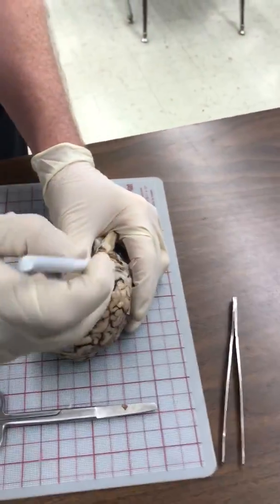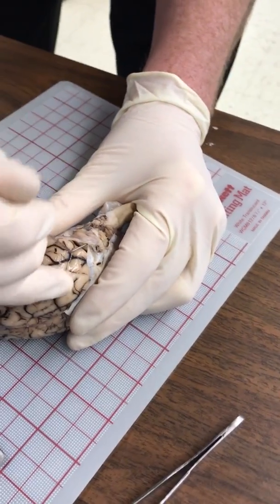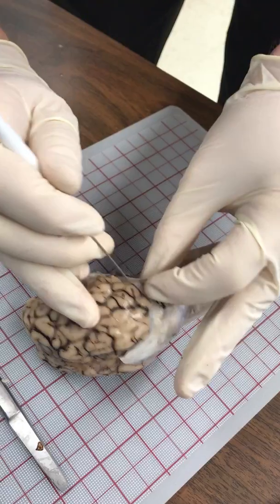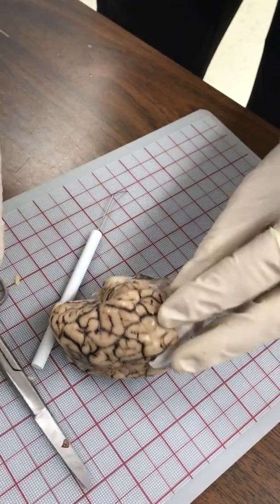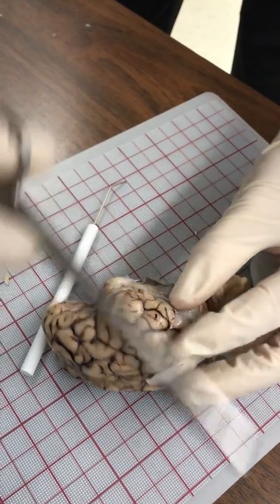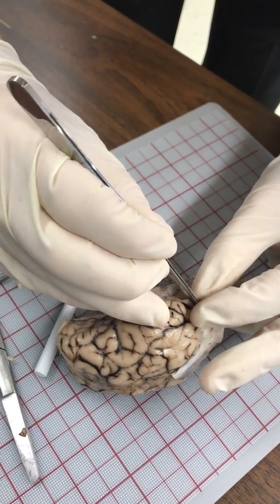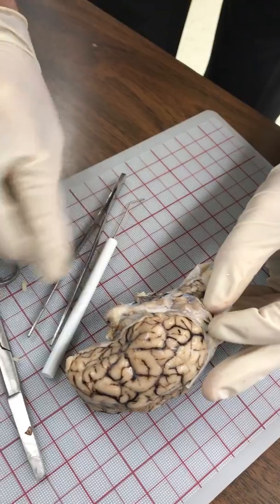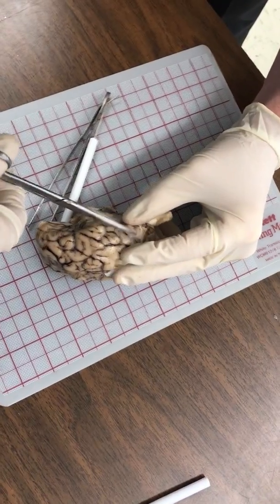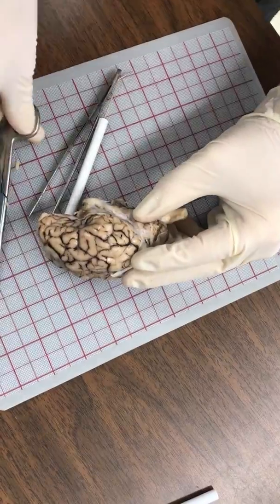Now here we're going to get a little bit trickier, because the dura actually goes between the different hemispheres. I want to get in there so I can see what I'm working with before I cut. I'm going to use my forceps here. Notice I'm working on the side — not working right down the midline.